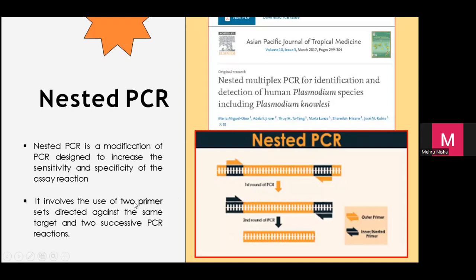So you have 2 primers here. So kalau tuan-tuan dan puan-puan lihat di sini, you akan terperincikan. So you akan actually concentrate the amplicon. So that is why we call it nested PCR. Terperincikan dia punya results. Okay.